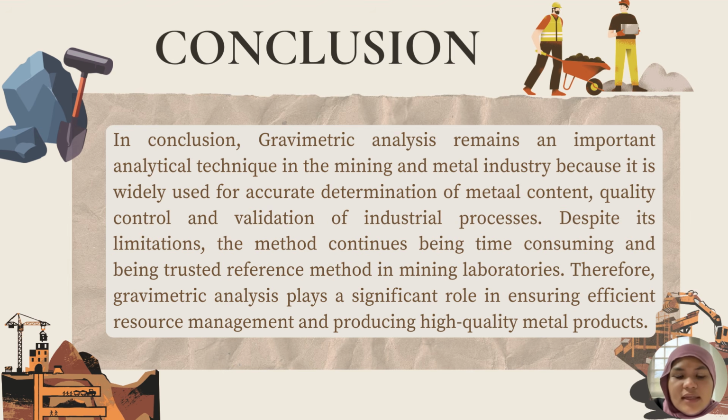Its high accuracy and reliability make it valuable for quality control and industry decision making. Although the method can be time-consuming, it remains a trusted analytical technique in mining laboratories. Therefore, gravimetric analysis continues to contribute to efficient resource management and the production of high-quality metal products.